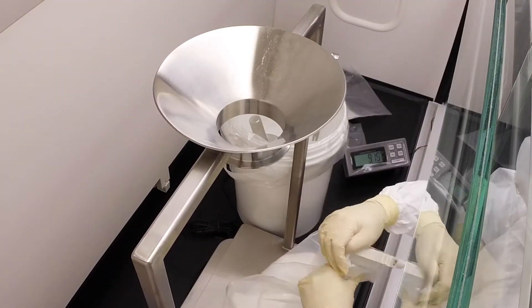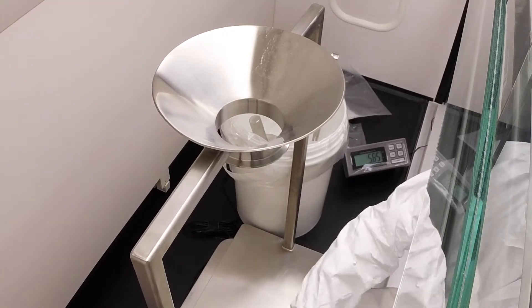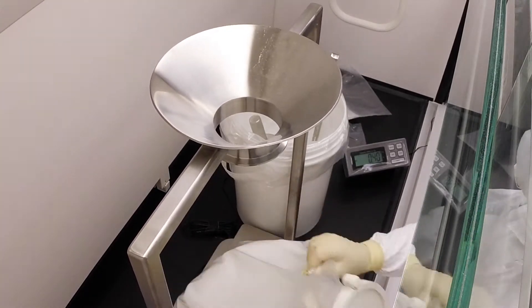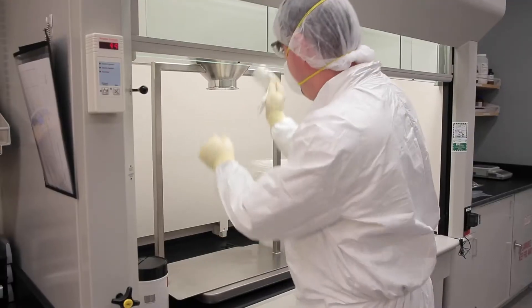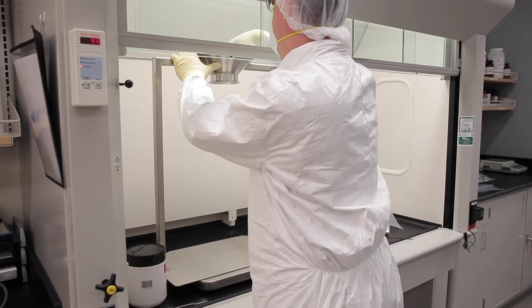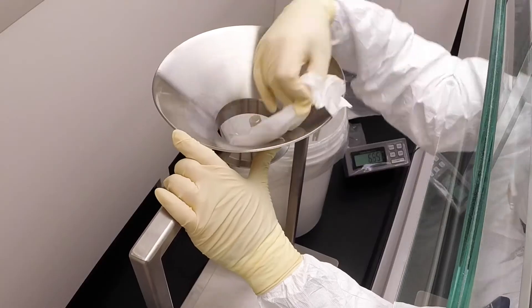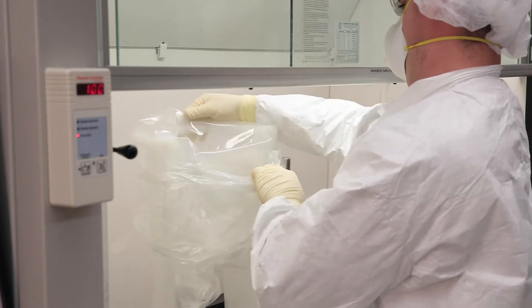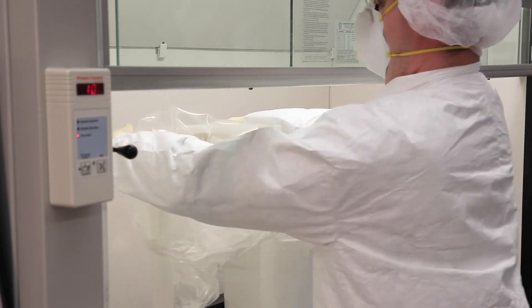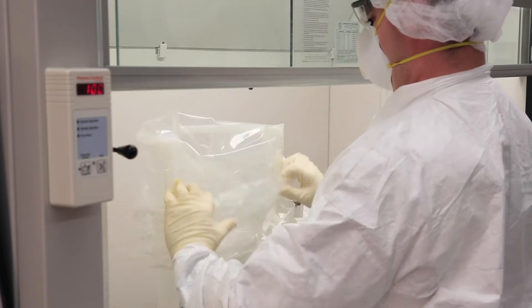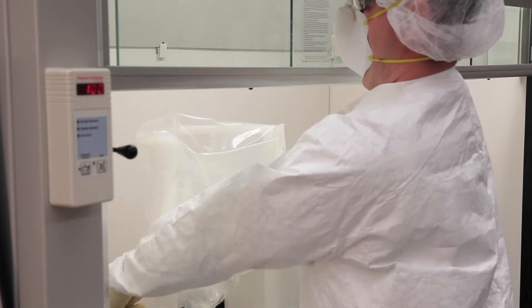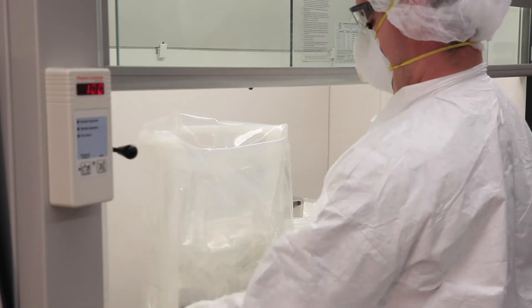Other systems' single-use bag exteriors can become contaminated when product spills, overflows during filling, or settles out of the air, requiring wipe-down of the bag's exterior surface, filling funnel, and support stand. Not so with EZ-Biopac. An integrated protective skirt folds down over the EZ-Biopac's polypropylene support stand, as well as the exterior of the bag, to prevent contamination.